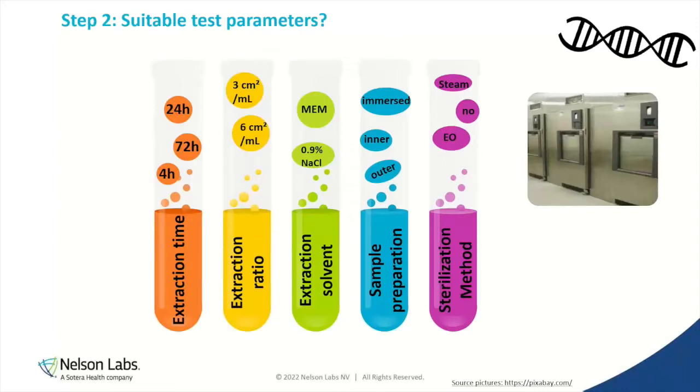The last thing to think about with test parameters, now you may think this doesn't relate because it's not a test parameter, but it's important to understand how the sample was manufactured beforehand. So thinking about the sterilization method, those can impact the device and the cytotoxicity test. If the device is terminally sterilized before a patient is exposed to it, we need to capture that step in the cytotoxicity test, but that can also impact the cytotoxicity test.